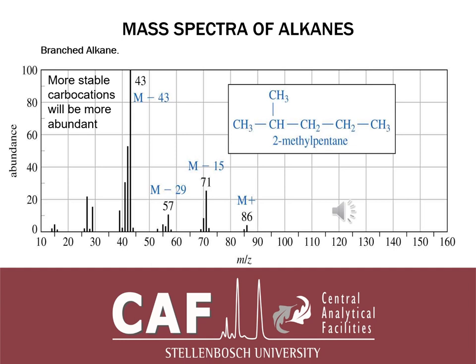That's what we call the base peak. The base peak comes from the most stable carbocation, because of the stabilization of the positive ion in that molecule, and then from there on it will be fragmented.